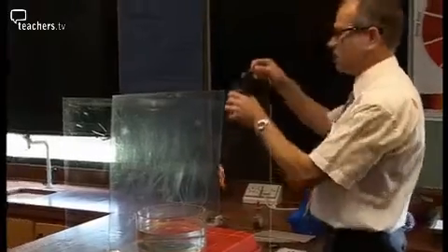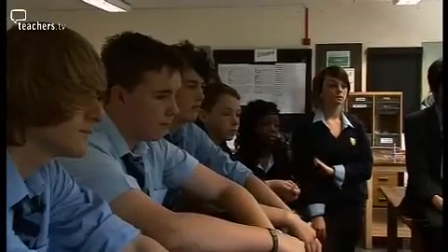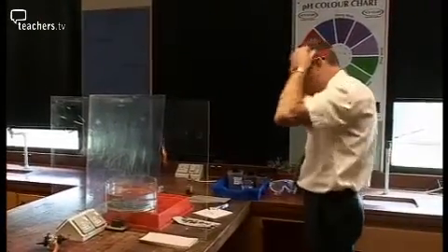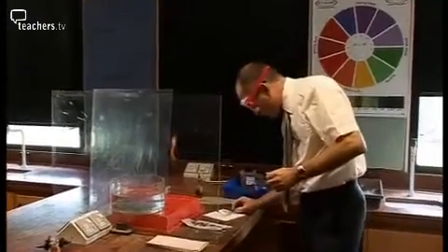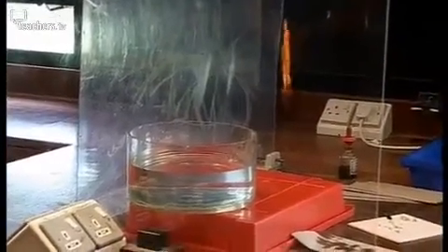Today, Nigel is looking at the periodic table with particular reference to sodium and potassium. We need to identify the features and properties of those elements. We need to be able to describe how those elements behave when they're reacting with water. So I'm going to put a piece of this sodium on the water, and I want you to tell me something that helps to describe what's going on.